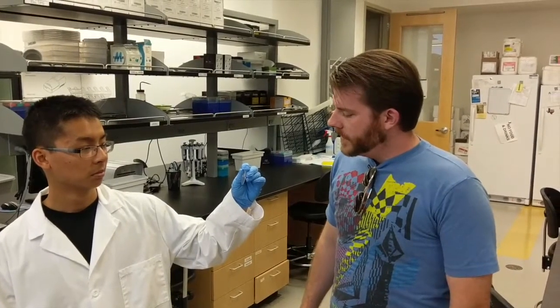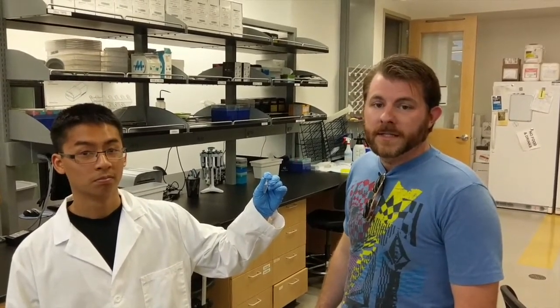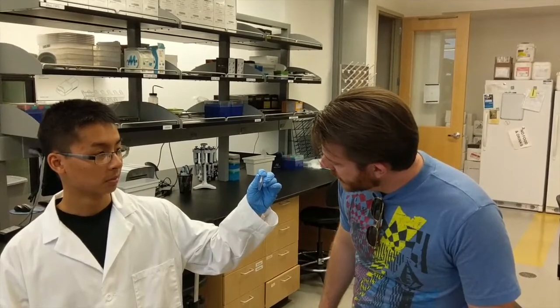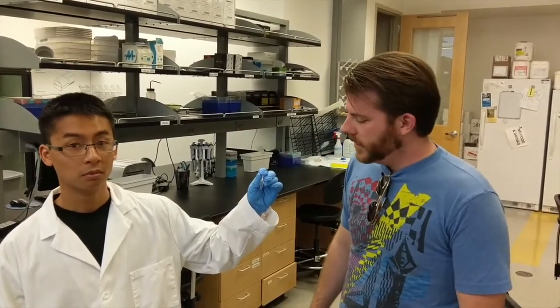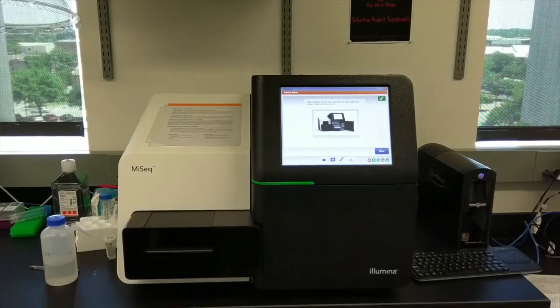Now after all those steps, we have our final pooled samples prepped and ready for Illumina sequencing. Doesn't look like much, but this is the end work of our entire process, and it has lots of DNA ready for analyses. Now that our samples are ready for sequencing, here's the MiSeq where we will sequence.